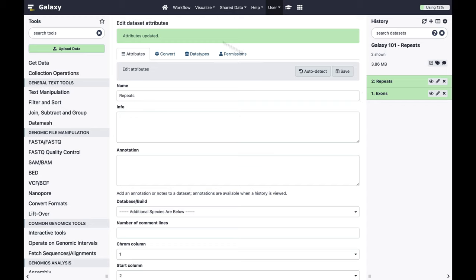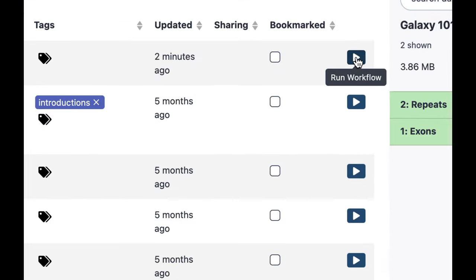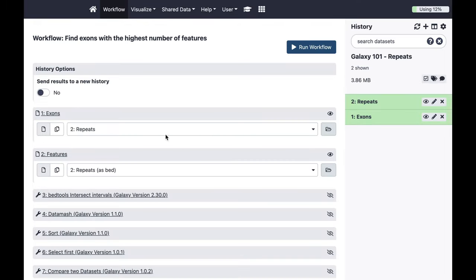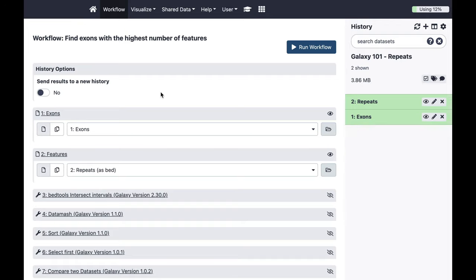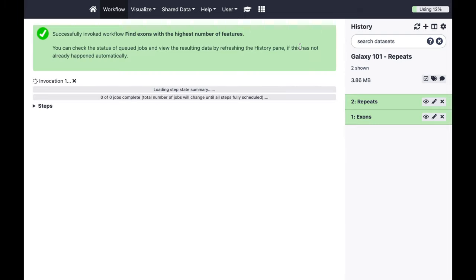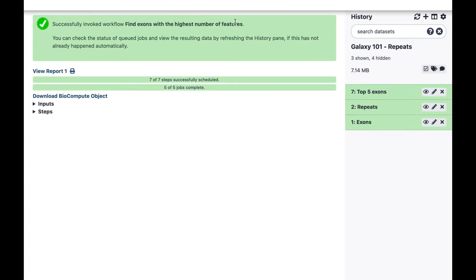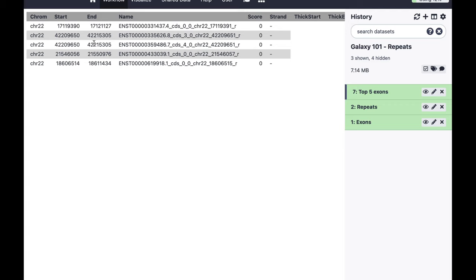Now I can simply run my workflow on these two datasets. Go to Workflow, click the Run button, use exons as the exons dataset and repeats as the features dataset. It shows 'bed' format because Galaxy identified it as an interval, but Galaxy knows how to convert interval to BED so it won't be a problem. Click Run. The workflow invocation display appears, and eventually you'll see the final dataset — the coordinates of the five exons containing the highest number of repeats.